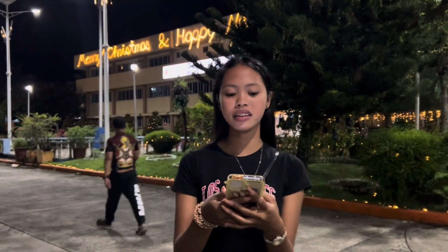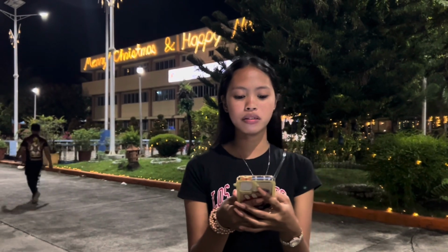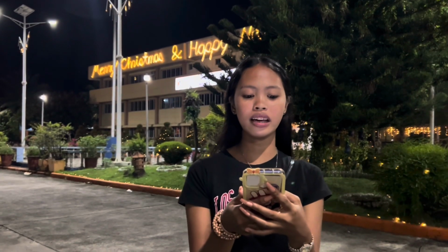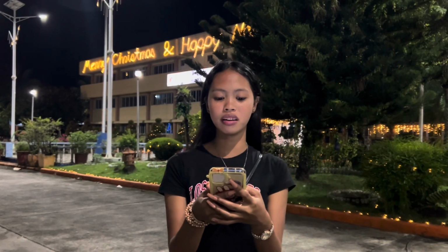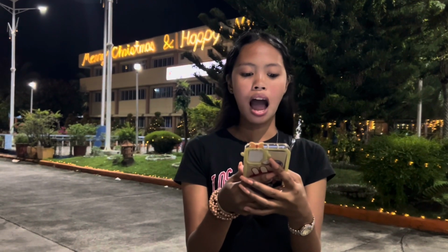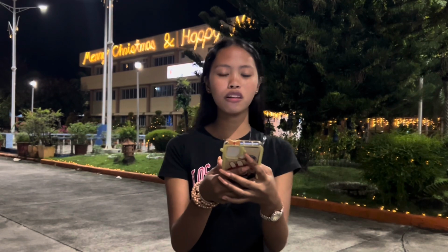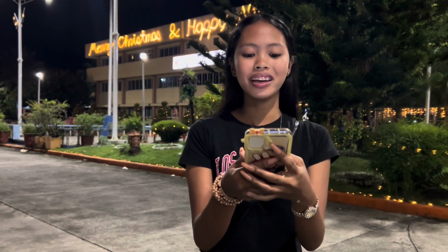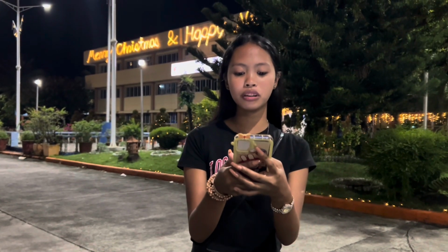9. Bunsen burner. This apparatus produces a single open flame, and it is used for heating and sterilization purposes in the various experiments conducted in labs. A laboratory often needs a lot of things heated or boiled, and the Bunsen burner was tailor-made for this purpose. It runs on standard LPG fuel and can reach a fairly respectable temperature, unlike a spirit lamp.